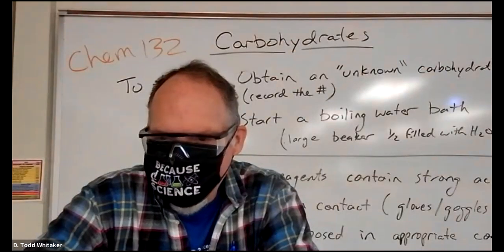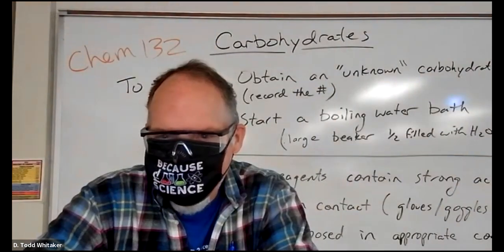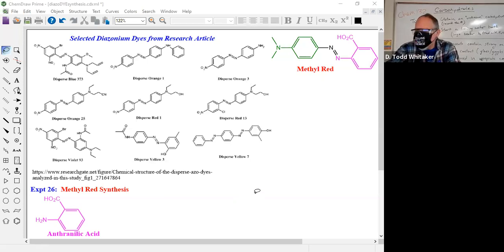Ladies and gentlemen, we're not doing a carbohydrate lab. That is for a different course. We are doing our methyl red synthesis today in lab. Methyl red is a diazonium dye.